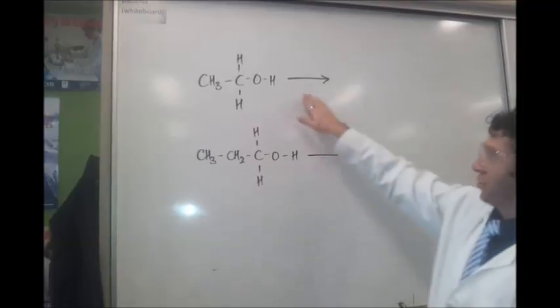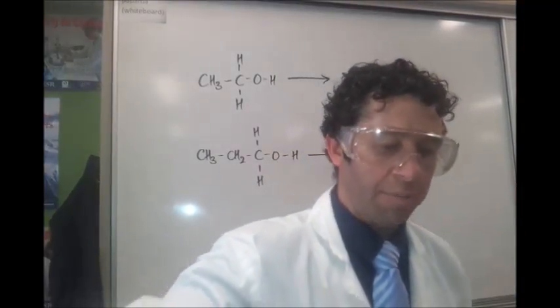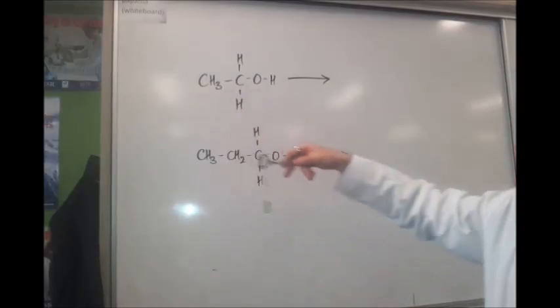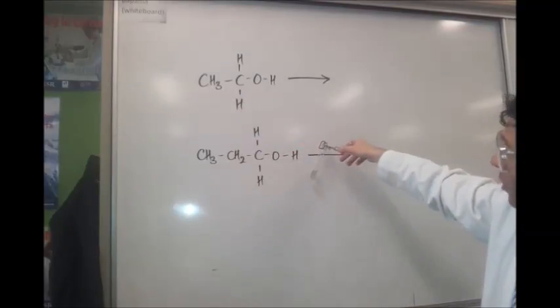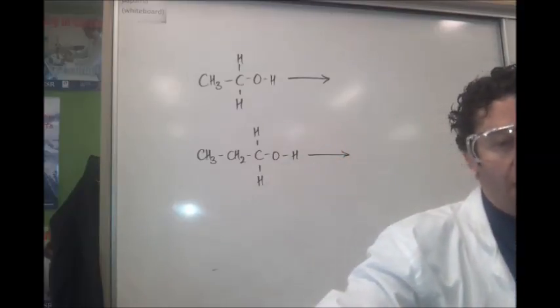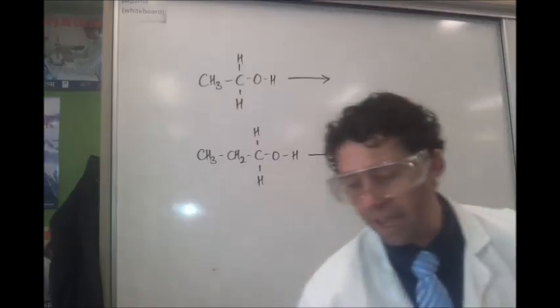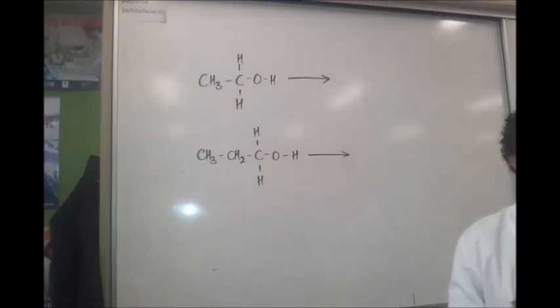Okay, what I've got here are the 2 reactions we've just done. The propane-1-ol, sorry, has also gone a greeny colour there, a little bit bluer than the last one actually. It's actually reacted further. So in both of those cases, the alcohol has been oxidised, and we can't be sure what it's oxidised to yet. We'd have to do some further separation.